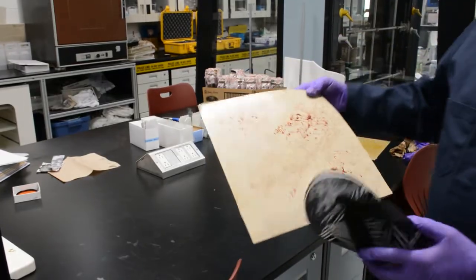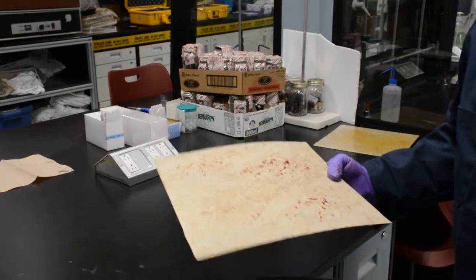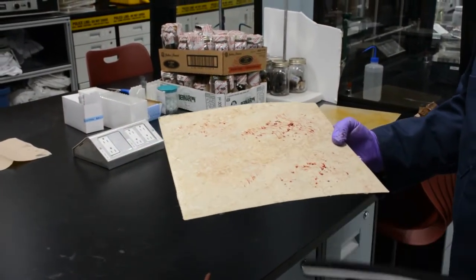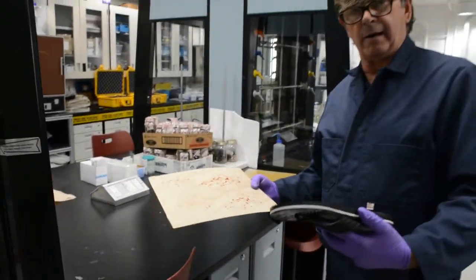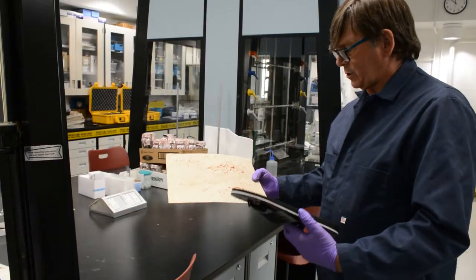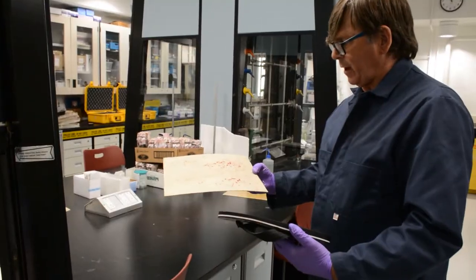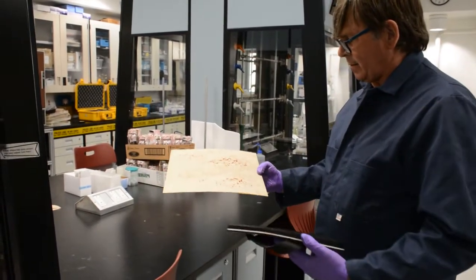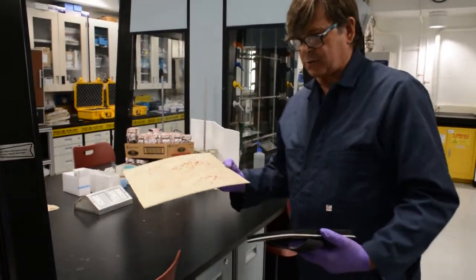Ideally, when you're using these enhancements, you want to make sure that the blood that is already on the surface is predominantly dry. So either allowing it to dry just from time, or aiding it by using a mild heat from a hair dryer just to dry the blood. So we're going to let this sit aside for a few moments to have the blood coagulate and maybe dry a little bit before we go to the next stage of enhancement.